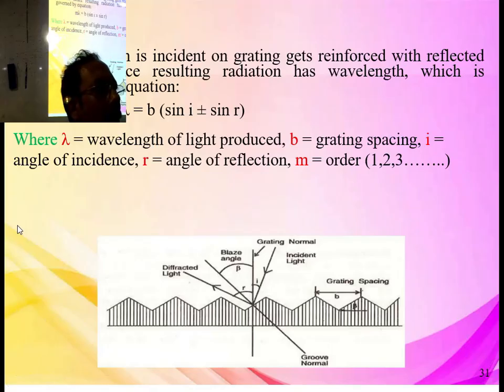One is the collimator lens, that is focusing. After that the prism. Prism is splitting the light into different patches or bands of light wavelength, right? Now every band, if you want to select it, has to pass through a slit. Again it is passing through one slit, maybe yellow color or maybe orange color. A particular one you are passing through some hole. That is called a slit once again. Then this contains maybe 20 wavelengths. Out of the 20 wavelengths, one you have to select. That you are doing by grating.